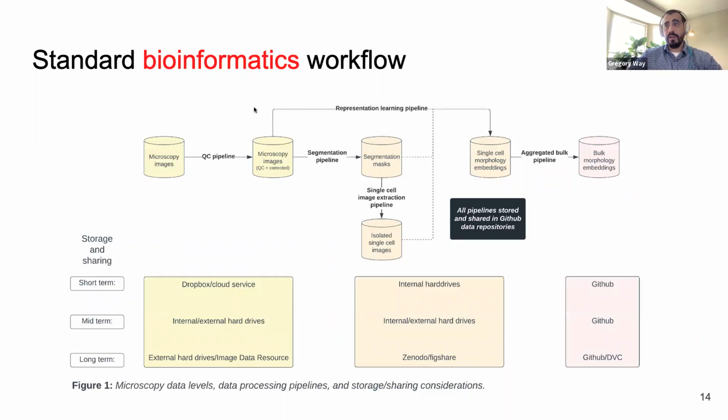And so now to go a little bit deeper into the bioinformatics, this is another view that's focused on the data. So from a data-centric perspective, we start with the rawest form, which are the images that come off of the microscope. Each of these arrows represents various more or less standard bioinformatics pipelines that are used to process one data type to convert it into another. So for instance, this QC pipeline typically involves removing debris or removing out of focus images or trying to adjust for them, and correcting for background intensity or illumination correction.